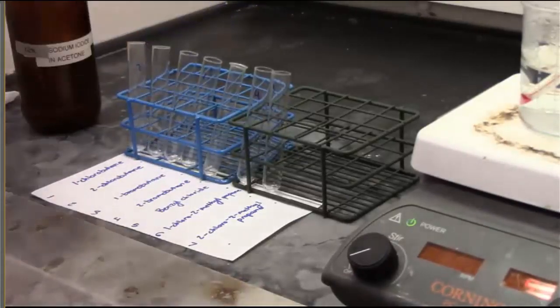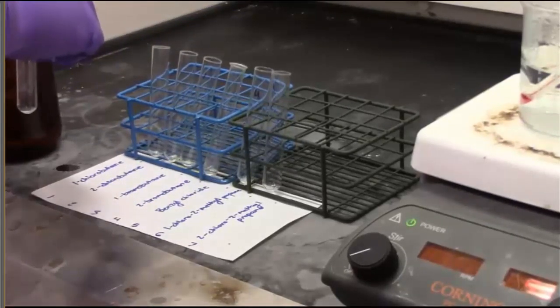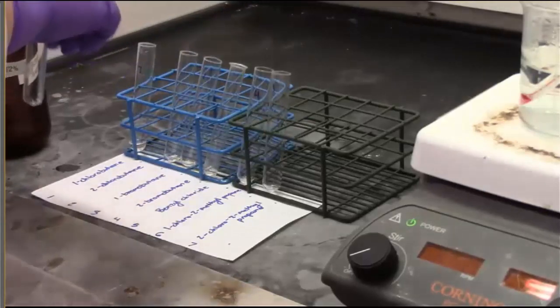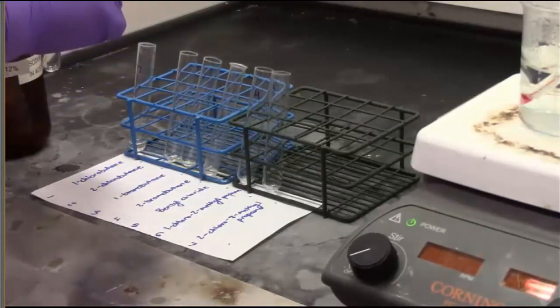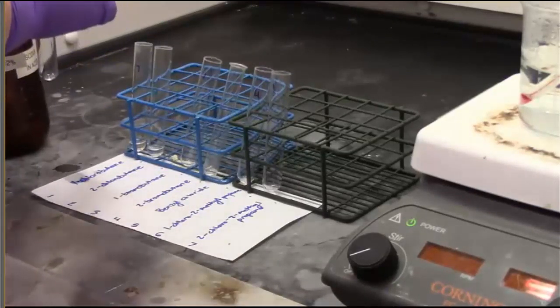And now we have sodium iodide dissolved in acetone, and we are going to be adding that to each individual test tube. There's actually a pump on top of it that you can't see that's set to 1 milliliter, which in the table of reagents that we'll look at later is equivalent to 1,000 microliters, and that is exactly how much we're adding to each of these test tubes from the pump on that solvent container.